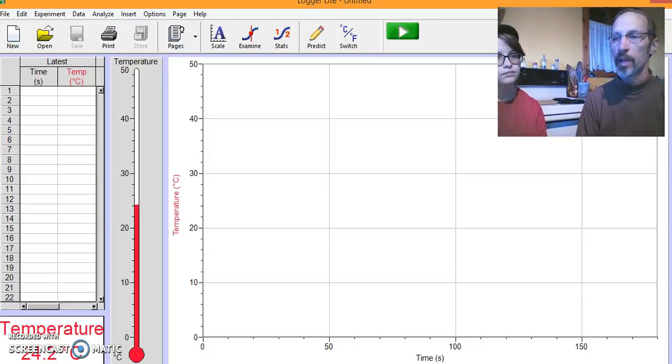We've been learning about using graphs and collecting data. We're going to learn how to gather our data and save it on a graph, and then we're going to try to analyze what we observe by using our data. Let's talk about the experiment a little bit here. So we're going to heat a mixture of water and isopropyl alcohol, and they both have different boiling points. Do you remember we looked those up?